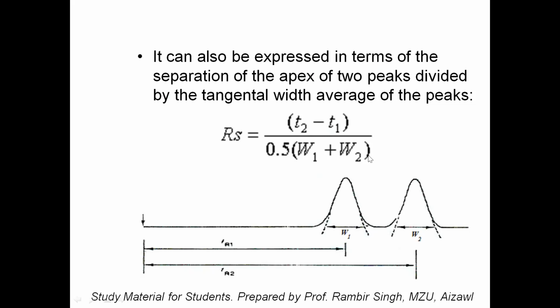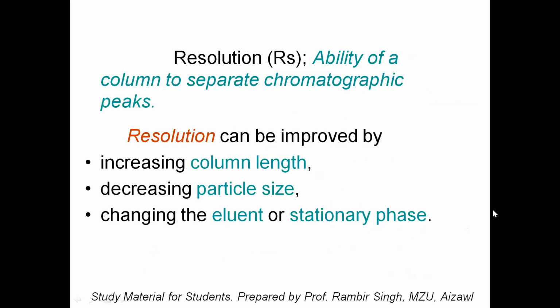So this is TR1, and this is TR2, the retention time for the second one. This way we can calculate and find out how the resolution is enhanced.